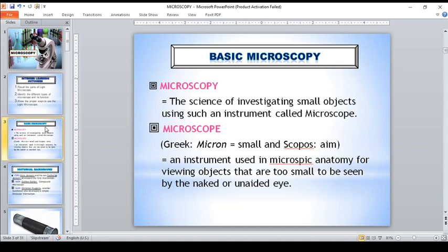So, going back again to culture and sensitivity to determine if there are pathogenic bacteria in the urine, you can do that in the gram stain, but the gram stain is not a definitive diagnosis.